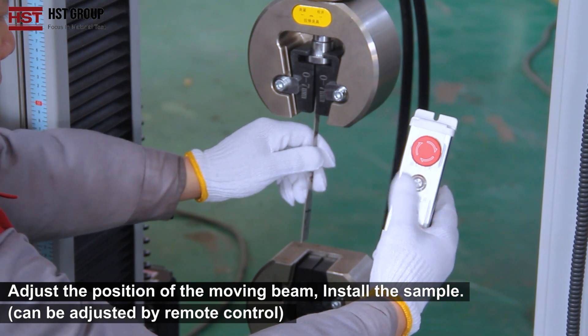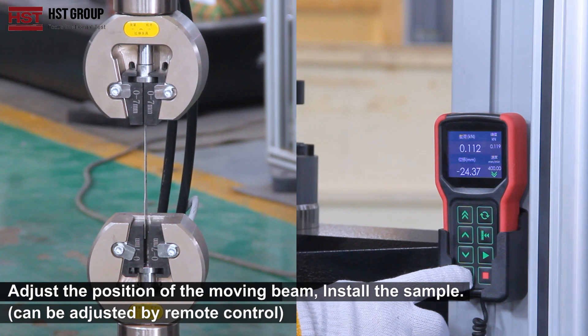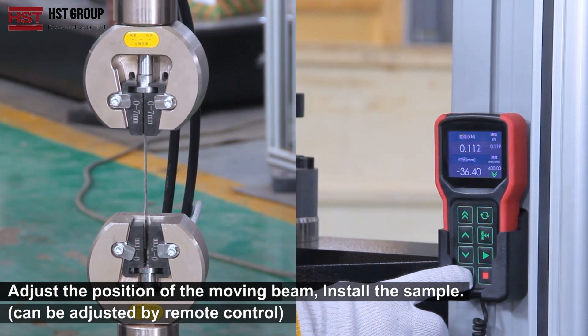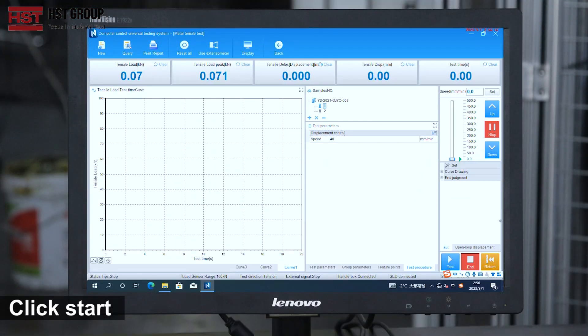Adjust the position of the moving beam. Install the sample — it can be adjusted by remote control. Click start.